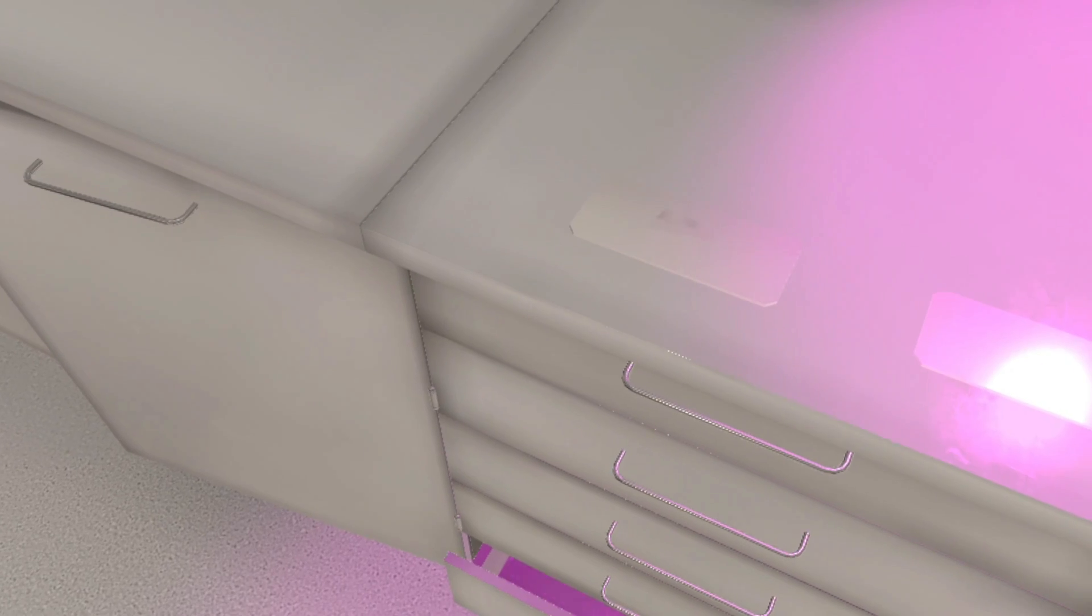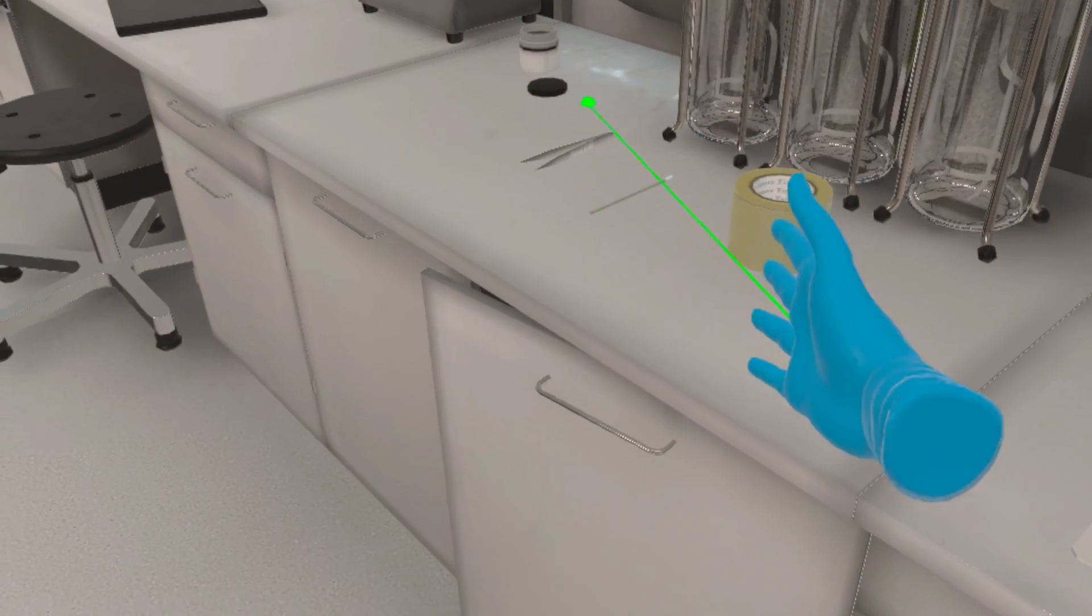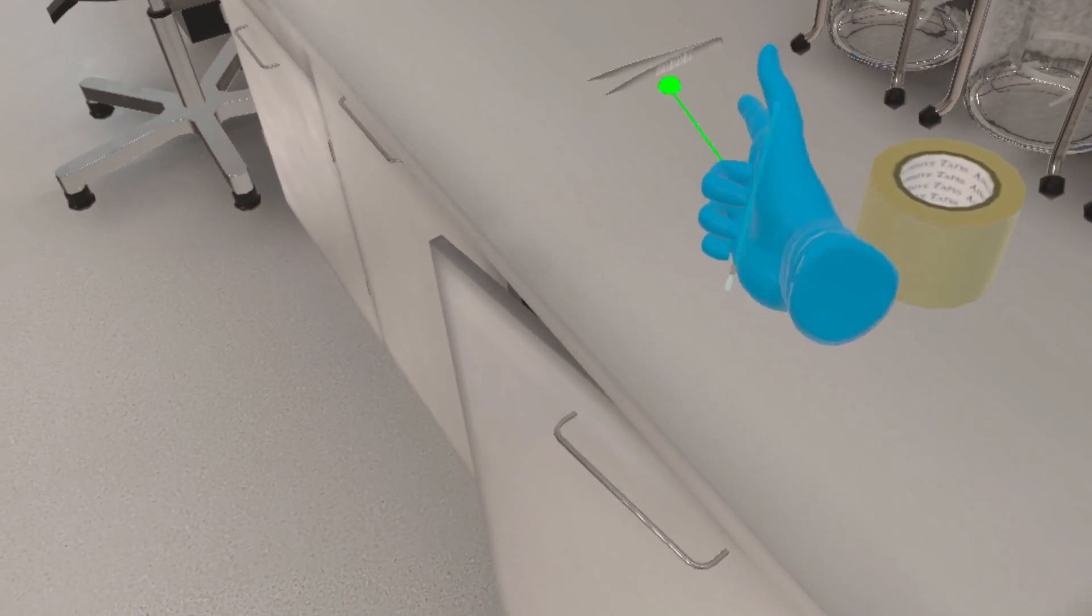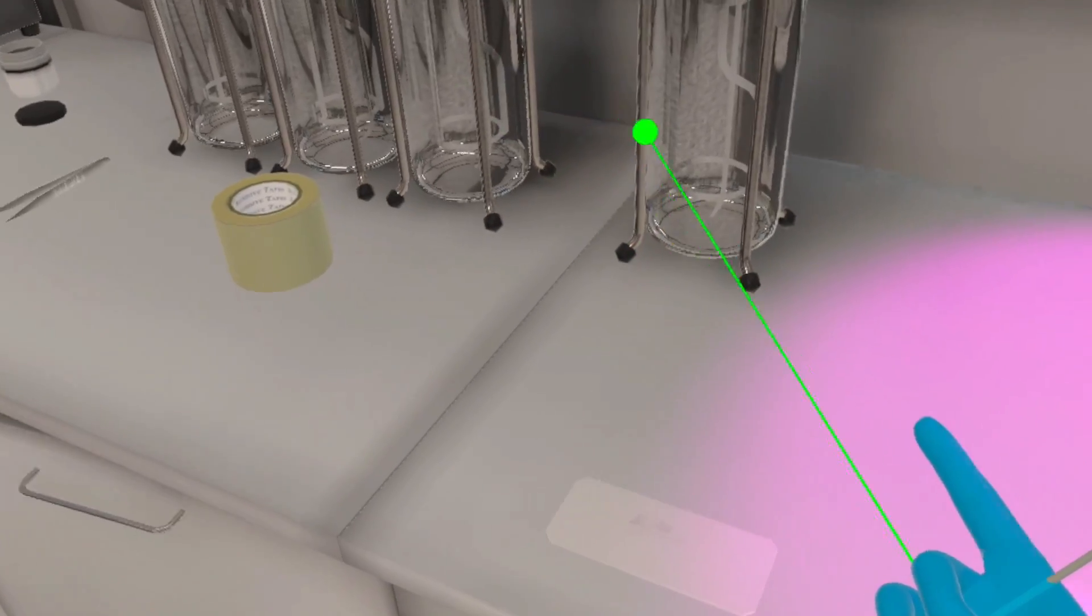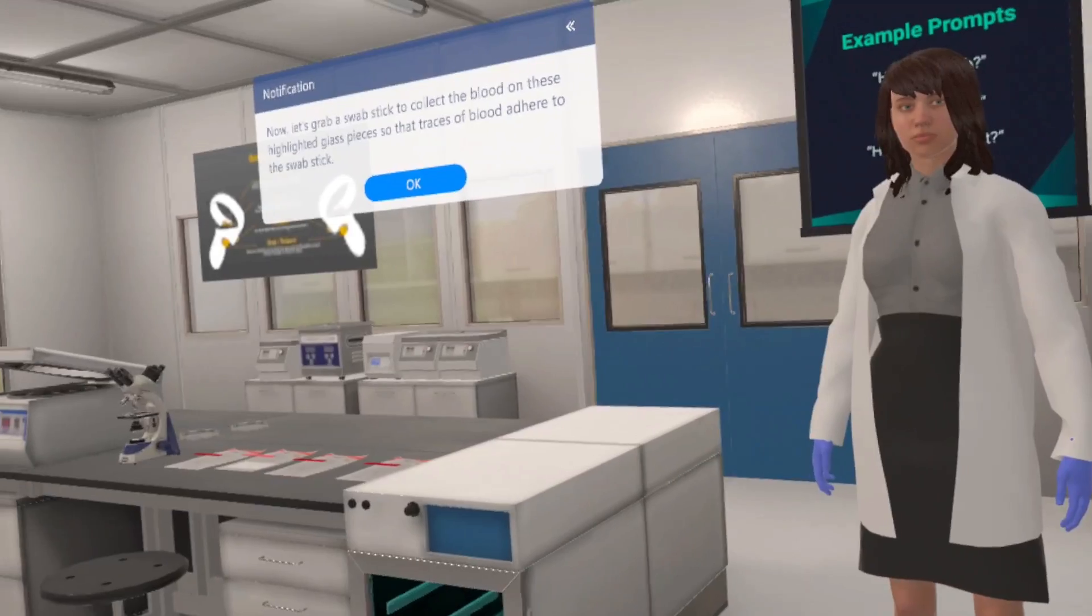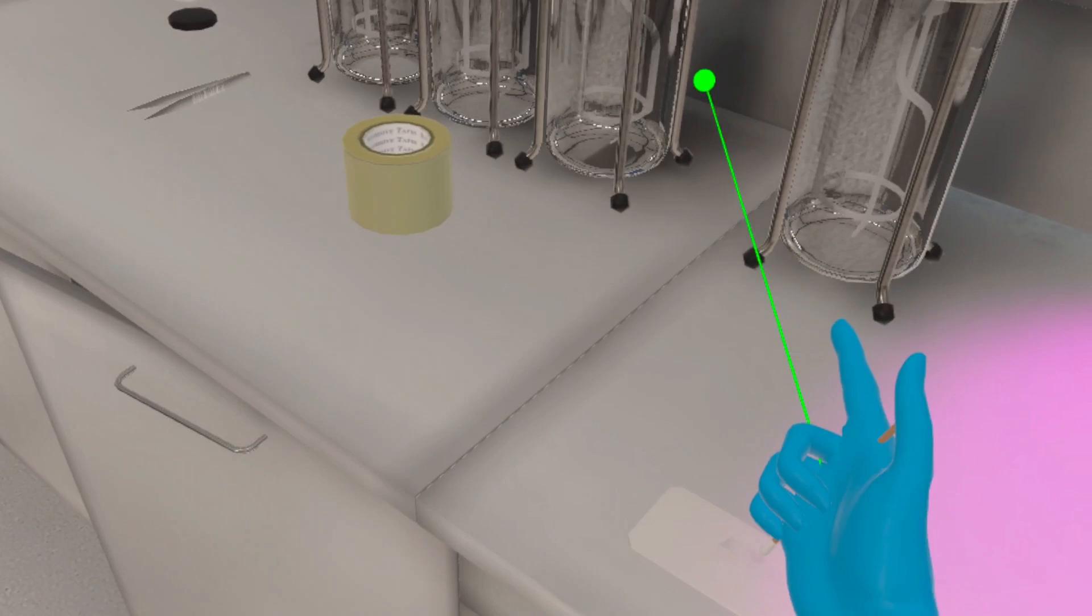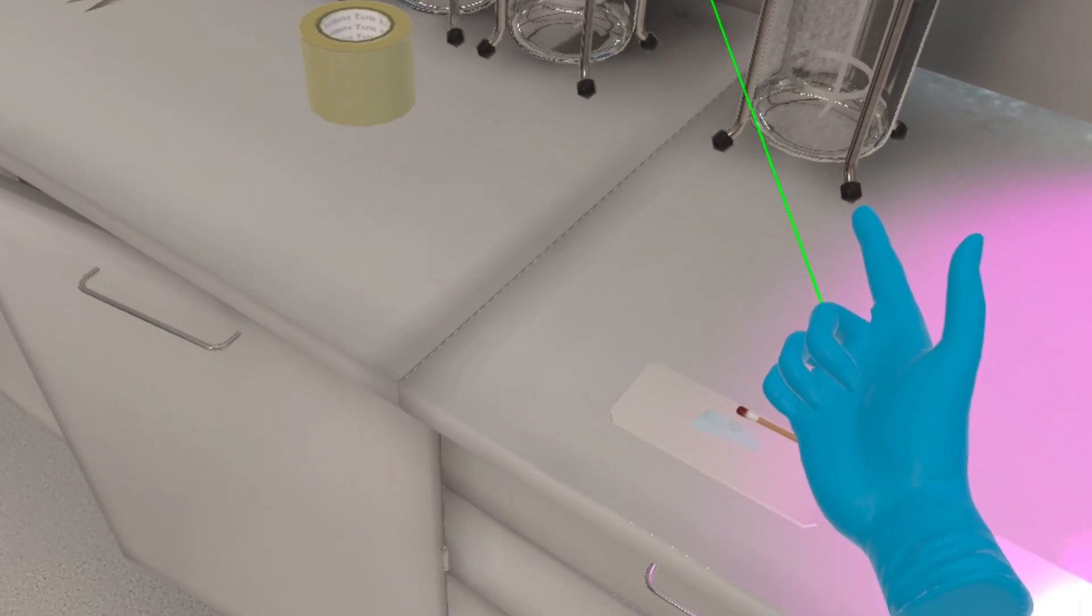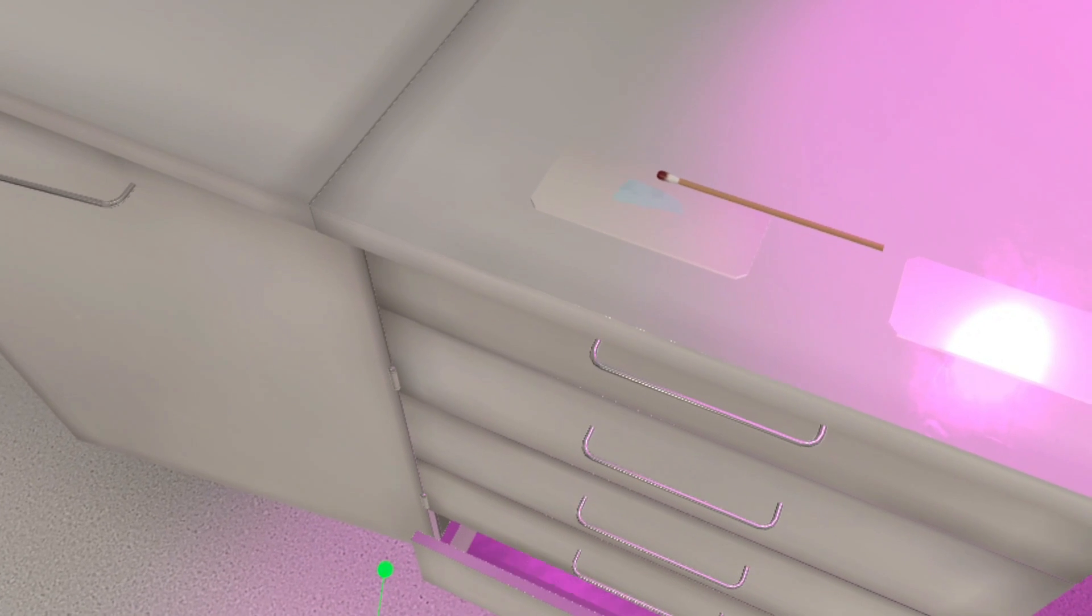Now let's grab a swab stick to collect the blood on these highlighted glass pieces so that traces of blood adhere to the swab stick. Place this swab stick on the glass slide next to it.